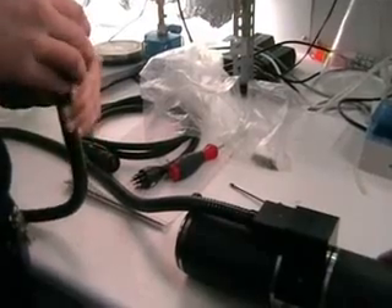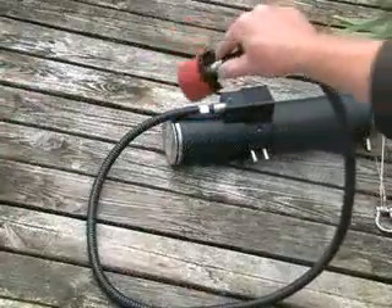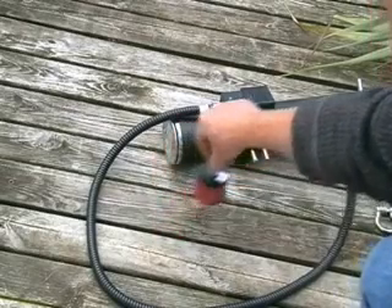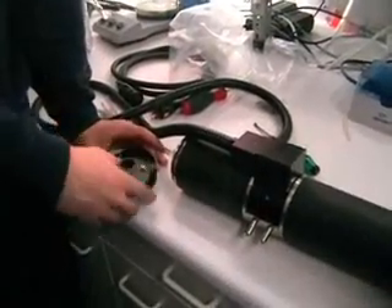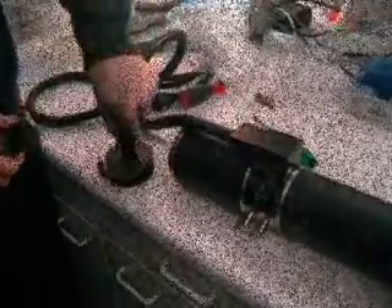To measure on stone or flat surfaces, the head is simply placed on the surface and slight pressure is applied to exclude external light, as shown. The rubber adapter ensures a constant distance between the fiber optics and the surface to be measured. The black plastic adapter head is normally fixed to the substrate by pins or pegs, and the cable end is simply inserted into the opening and held in place.